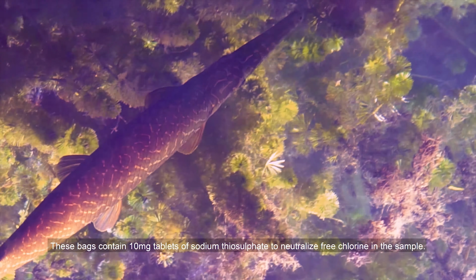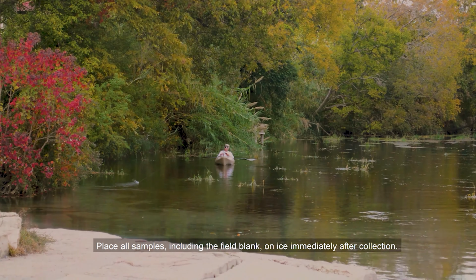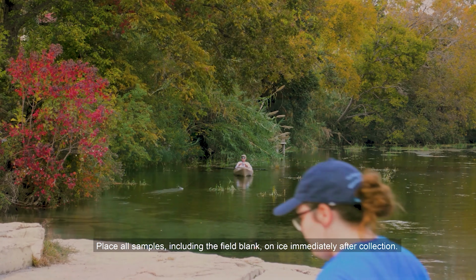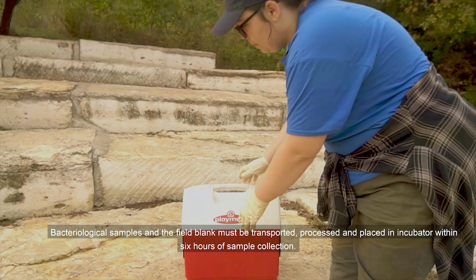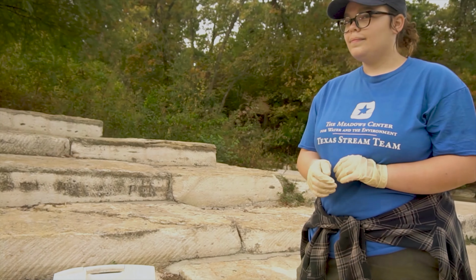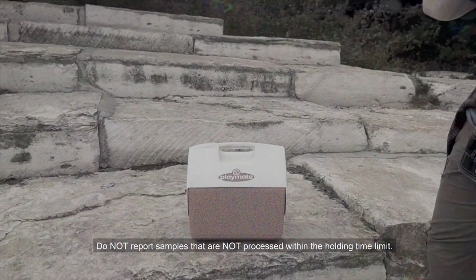Label each sample container with the station number, site name, date, and time collected. The field blank sample container will need to be marked with the previously mentioned information plus the words field blank. Place all samples, including the field blank, on ice immediately after collection. Bacteriological samples and the field blank must be transported, processed, and placed in incubation within 6 hours of sample collection. Do not report samples that are not processed within the holding time limit.